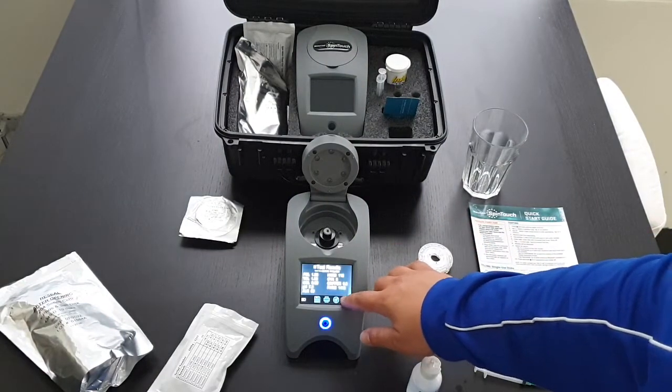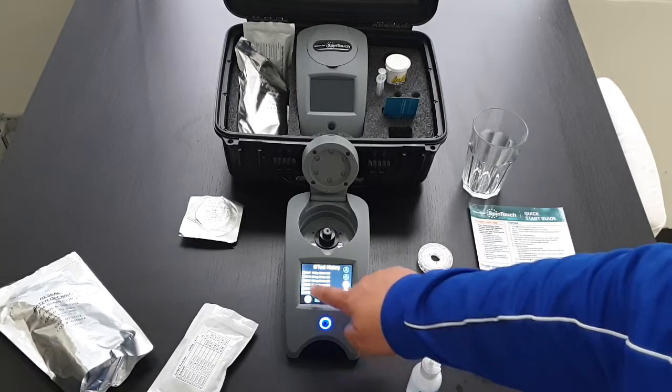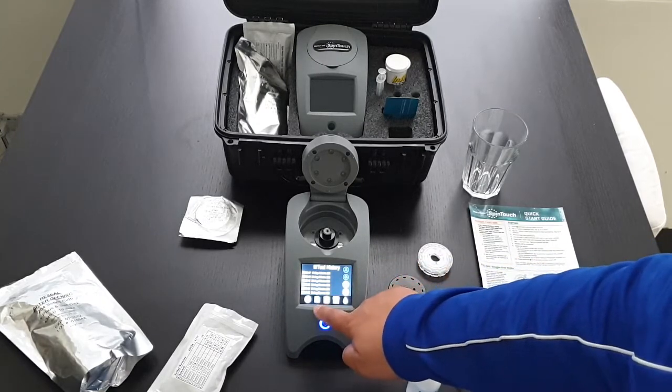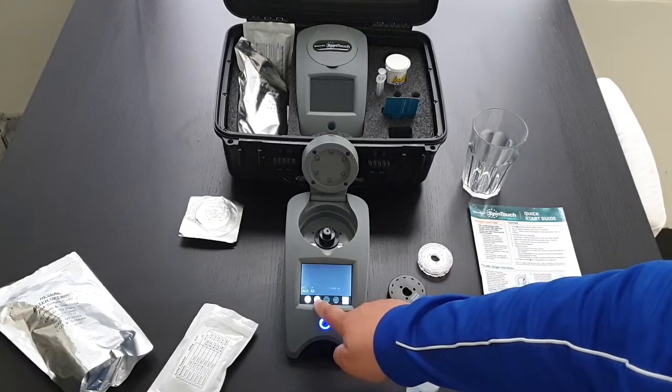After your test is done you can check the history. Tap the square box, select the tests that you want to read, press the page button, and you can scroll through past tests.